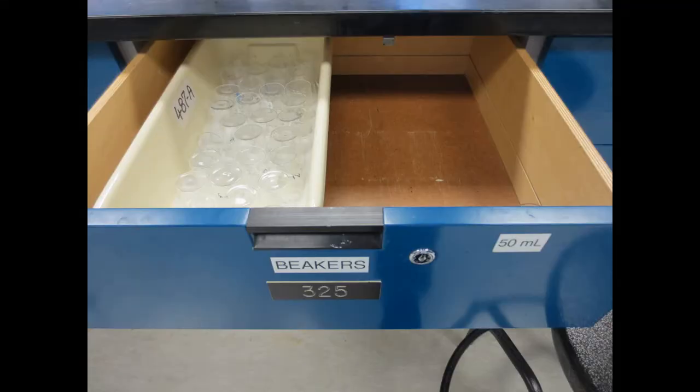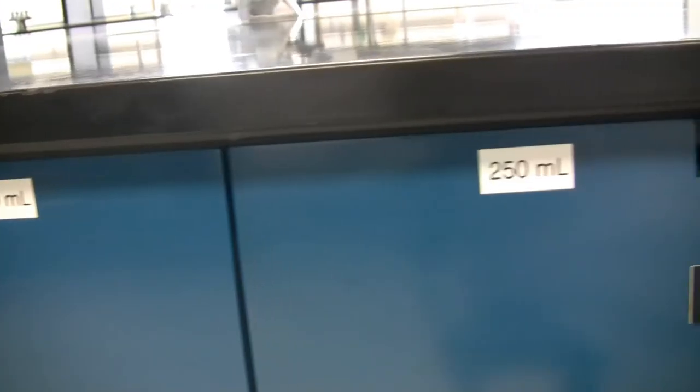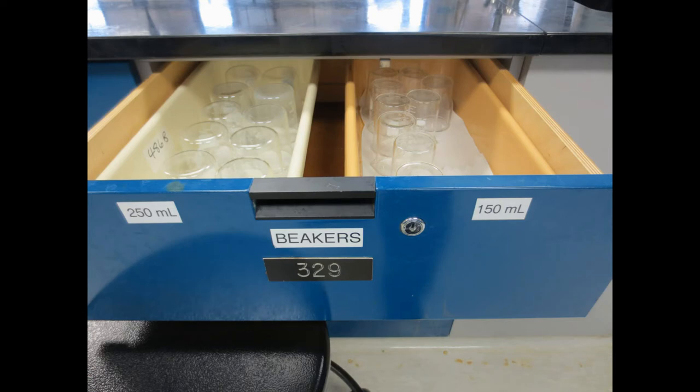50ml beakers. 250ml beakers, as well as 150ml beakers.